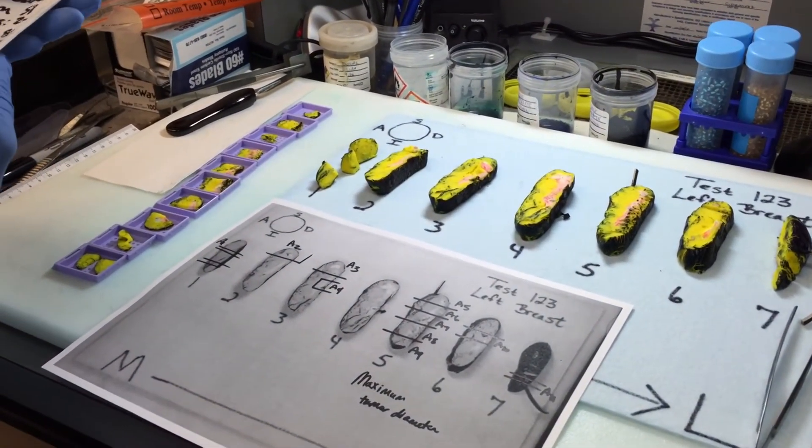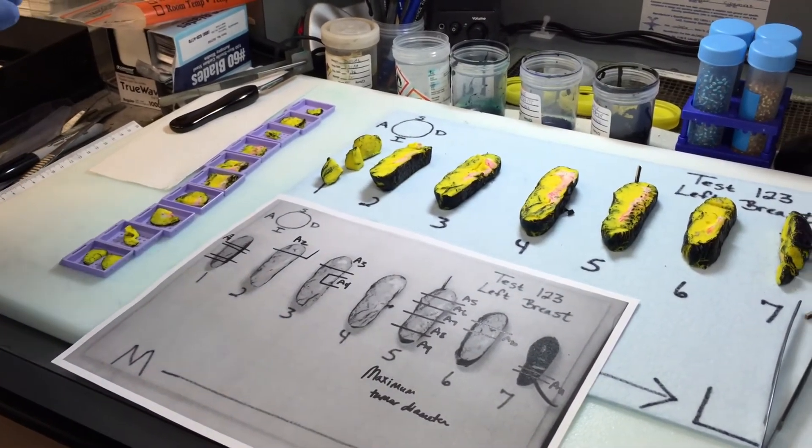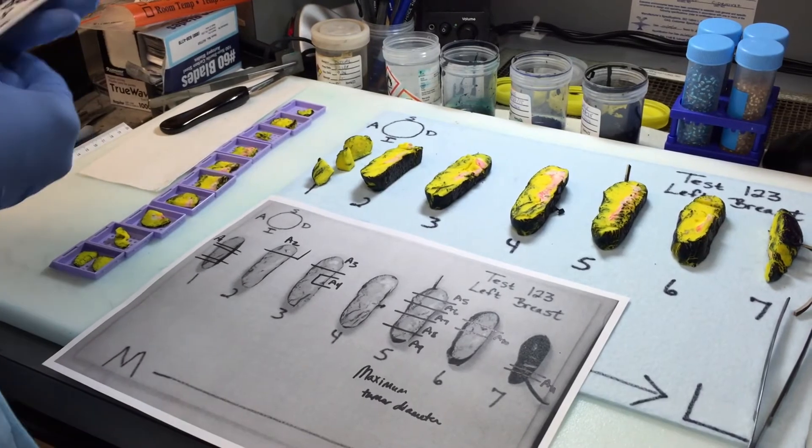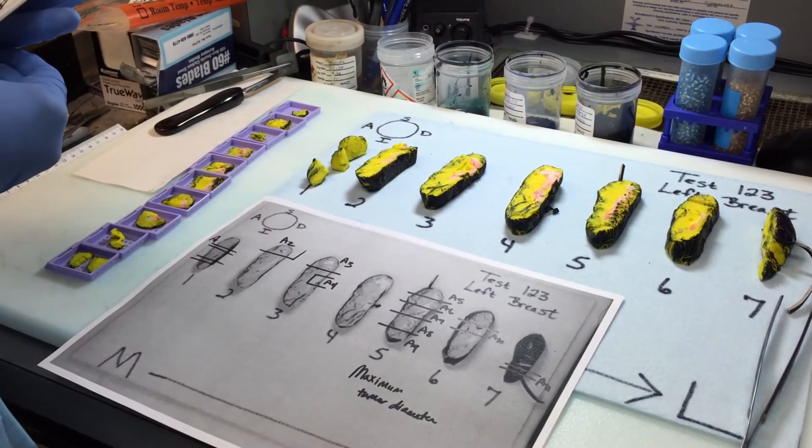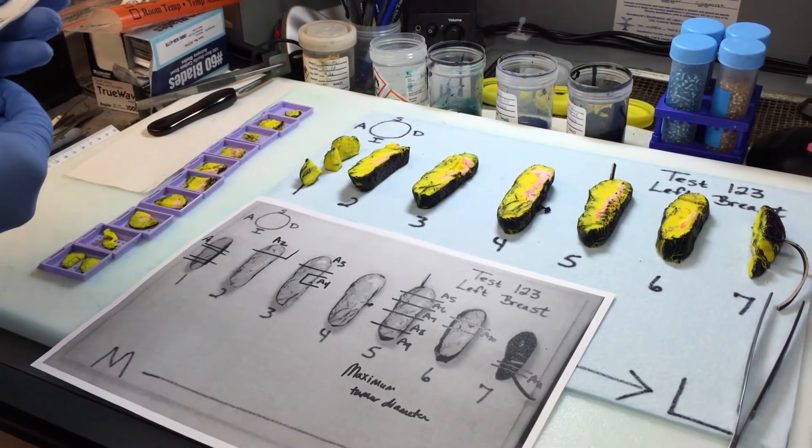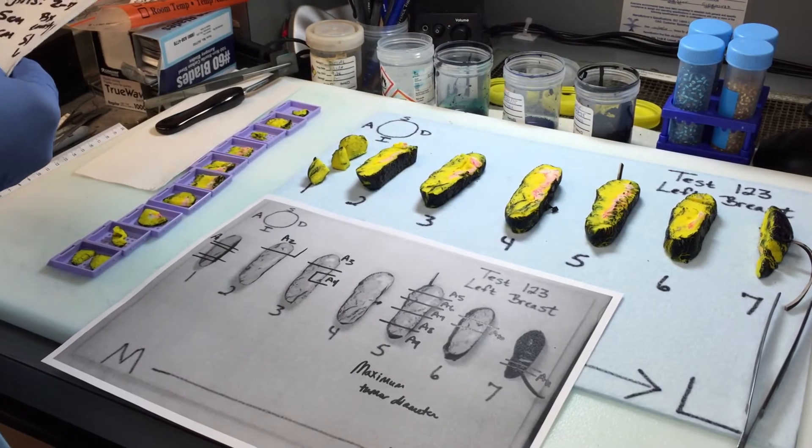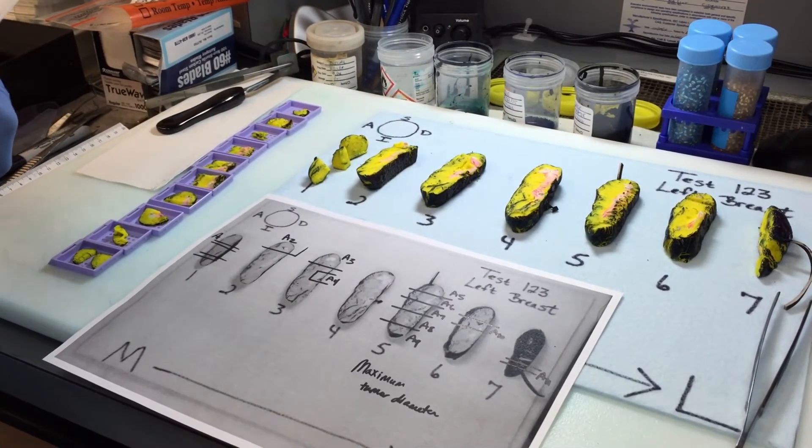The remaining breast parenchyma is yellow, fibroadipose tissue. In parentheses, the superior aspect is inked blue, the inferior is inked green, and the deep overlaid in black. Serially sectioned from medial to lateral in 7 reference slices. Representative sections in 11 caps.